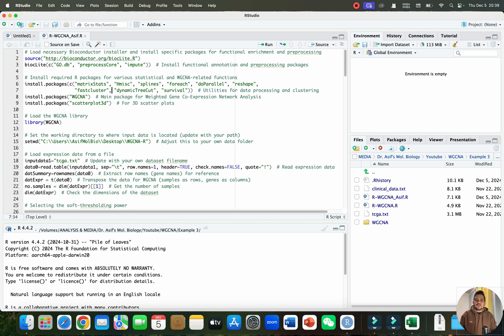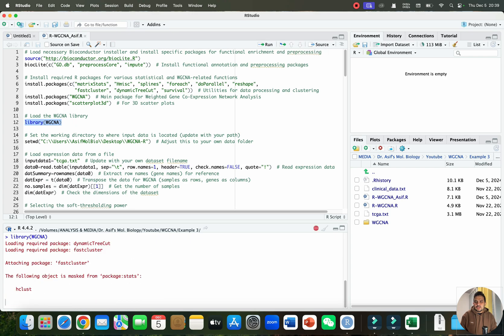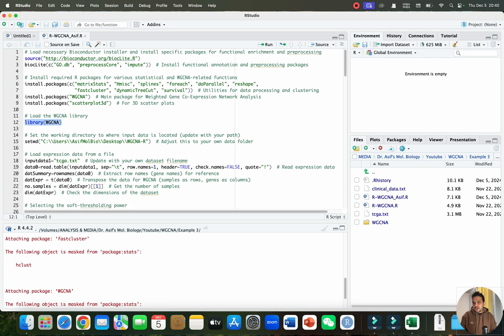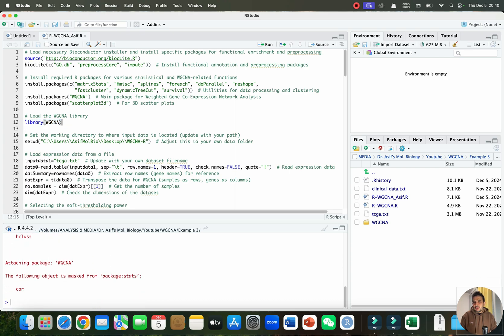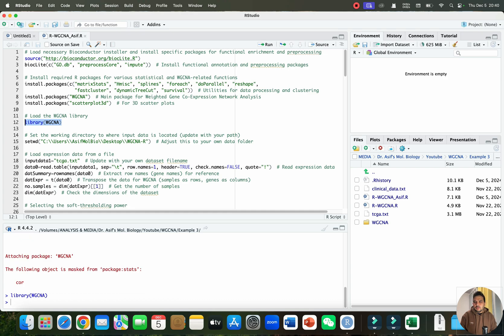Now let's go to RStudio. The prerequisite is to install the WGCNA package. If you want to go for functional enrichment and other functional annotation and preprocessing, you need to install additional packages including Bioconductor, and the scatterplot3d package. Usually installing the WGCNA package alone should be enough. Let me test — you can see it is already installed and loading correctly.